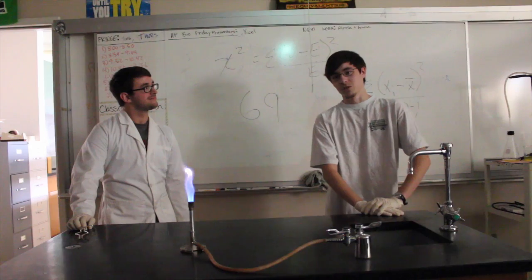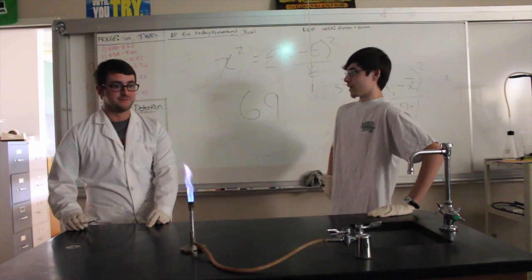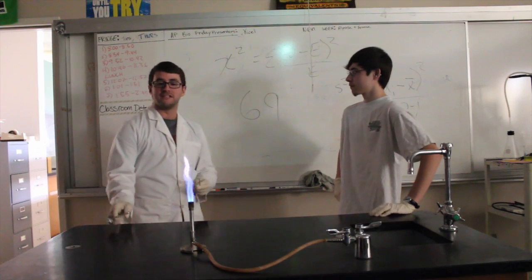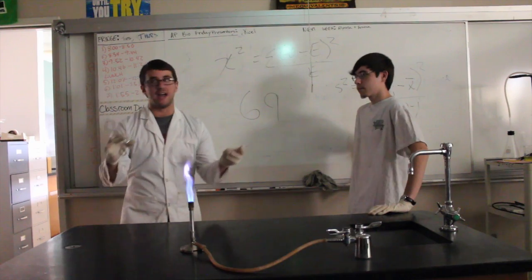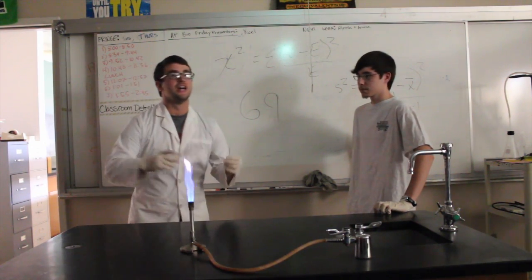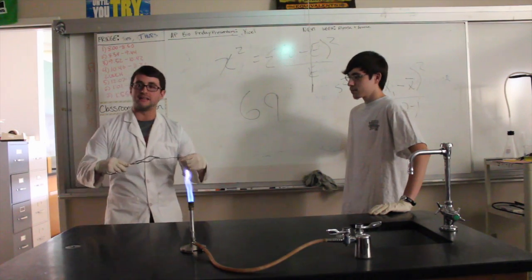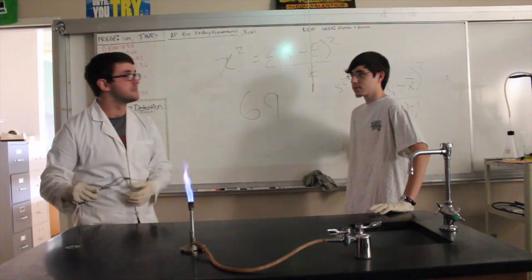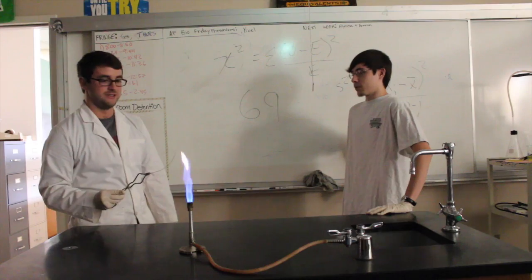So today, Mr. Daratha is going to perform a few science experiments for us. Can you tell us what we're doing today? Well, we're going to be doing a couple different things. The first thing is burning magnesium, which, if you had me last year, you remember from the first day of school. For those who haven't, a lot of times we think of metals next to fire just melting and nothing cool happening. This one is sort of the exception though. Do you have anything to add? No, not really. That's the basic gist.